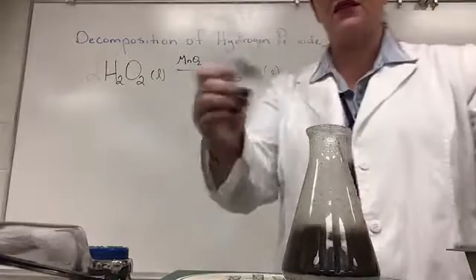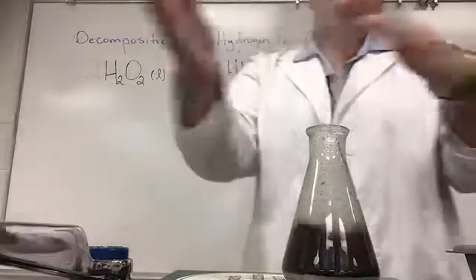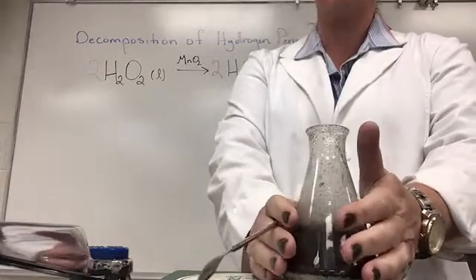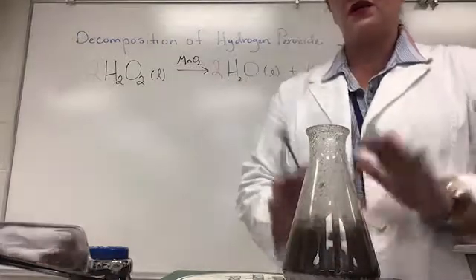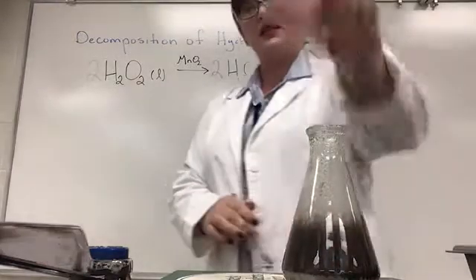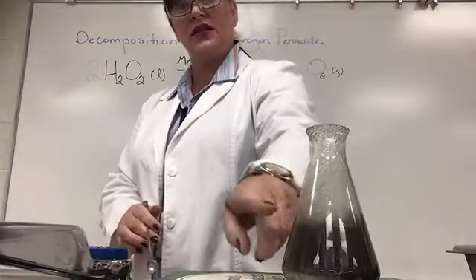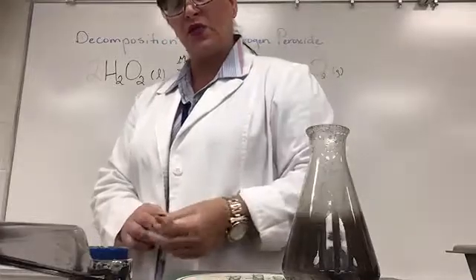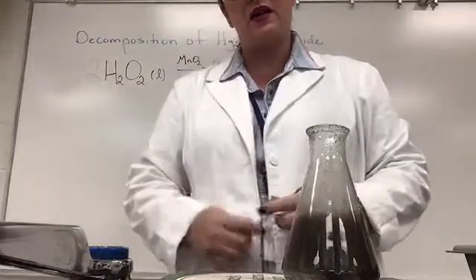Now you can see all this vapor that's coming up here. That's actually, this is very warm. This reaction is incredibly exothermic, so I'm not going to touch that. But this is actually, it's boiling. You can see it's rolling in here. And this is actually water vapor as it's boiling away, and it's carrying the oxygen out of it.